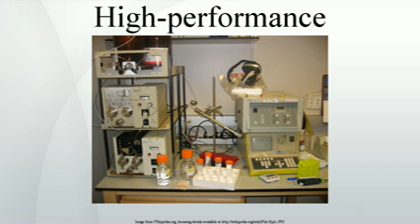Reversed phase columns are quite difficult to damage compared with normal silica columns. However, many reversed phase columns consist of alkyl-derivatized silica particles and should never be used with aqueous bases, as these will destroy the underlying silica particle. They can be used with aqueous acid, but the column should not be exposed to the acid for too long, as it can corrode the metal parts of the HPLC equipment.